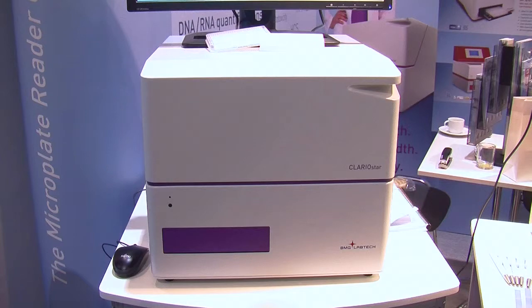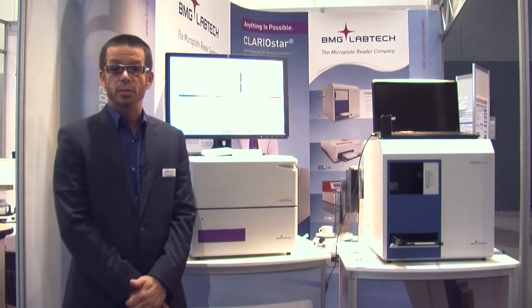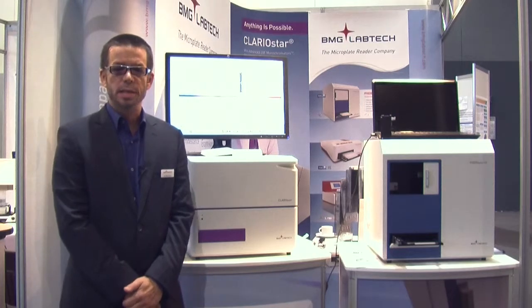The Clary Star is a high performance multi-mode reader. It has multiple different technologies to allow you to do multiple different detection modes: fluorescence intensity, luminescence, absorbance, alpha screen, time-resolved fluorescence, FRET, and BRET. All these assays can be done on this reader.